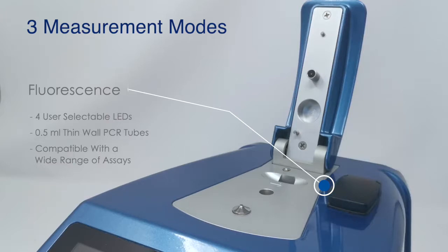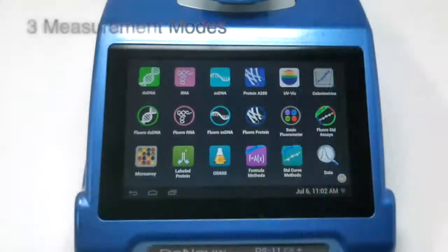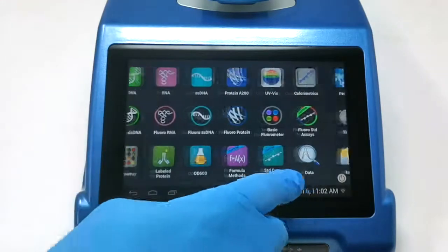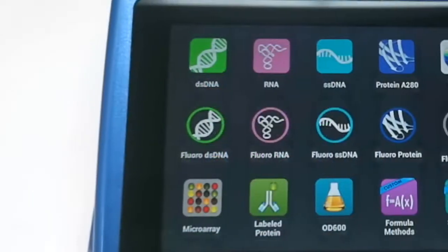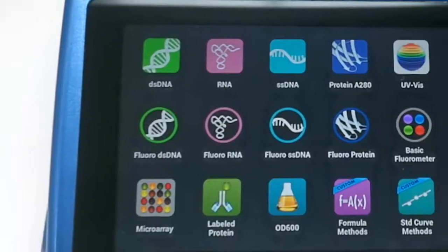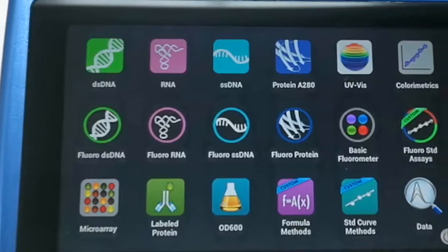So if we look at the instrument itself, the instrument is controlled by this touchscreen interface, so a high definition touchscreen interface, and all of the applications are separated into measurement apps. So you'll see on the screen we have a series of square apps along the top and along the bottom. These are all our UV vis apps. In the center we have some fluorescence apps, and they're all circular by design.